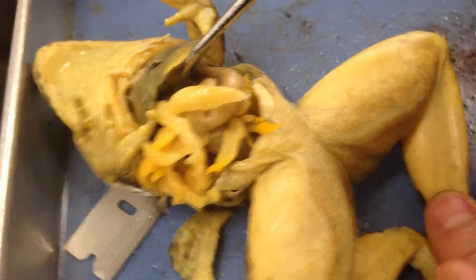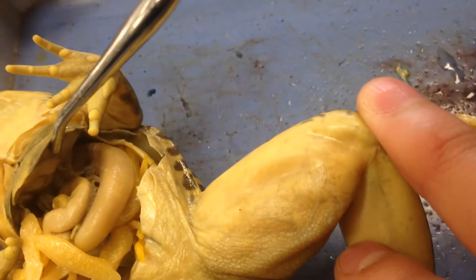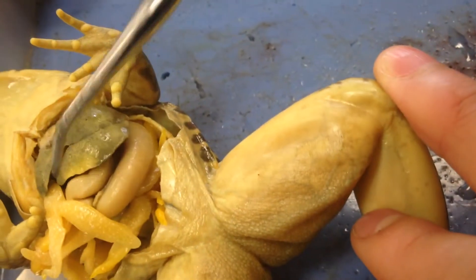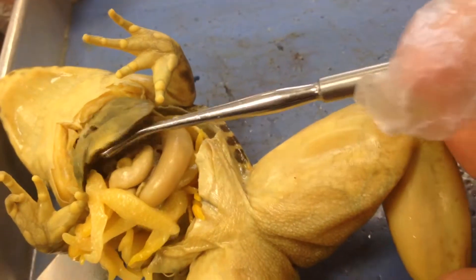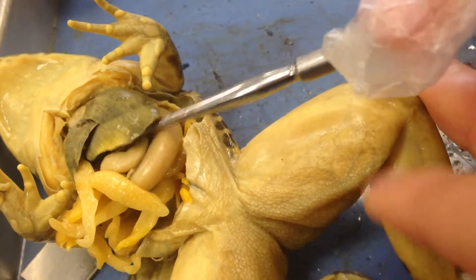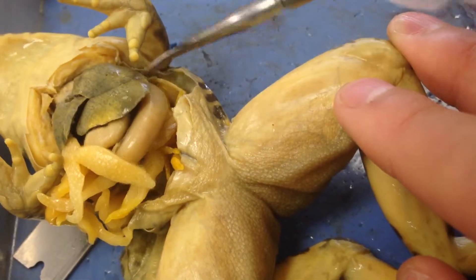The small intestine is coiled up, and underneath the liver there's some right over here. Let me position this — right over here is the small intestine. I'll pull that — the stomach is right over here.